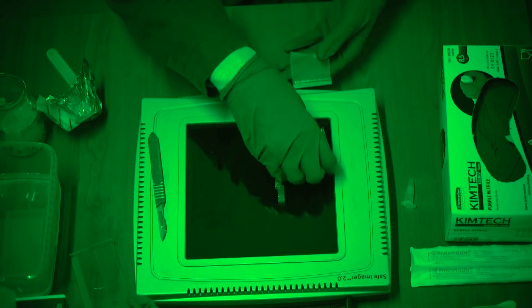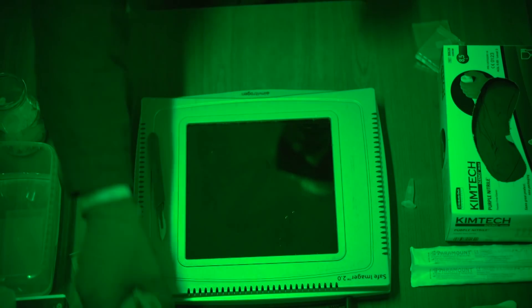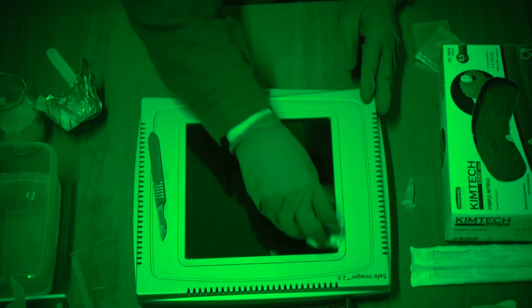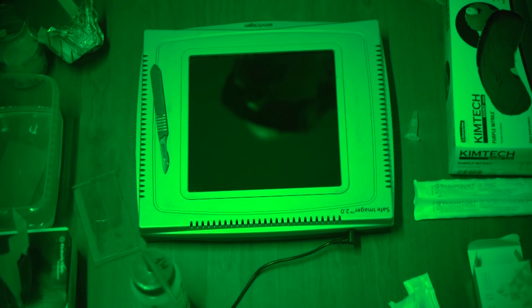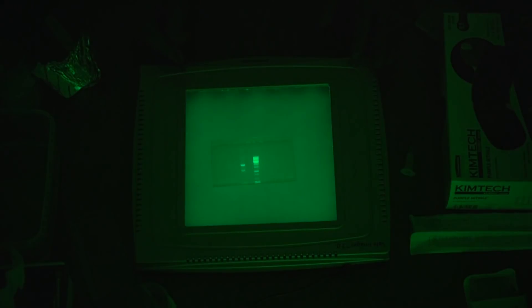Now I will clean up this gel for the next person. And for the second time through the procedure, we will enter fluorescence mode. Overhead lights off, illumination tool on, and there we have it. I can see — because I'm wearing these orange glasses that filter out all of the blue light produced by this illumination table, but not the green light produced by the fluorescently labeled DNA — I can see these bands perfectly, as I hope you can too at home.